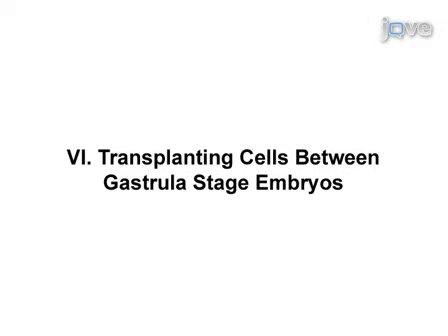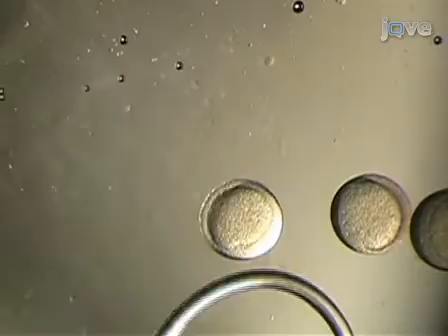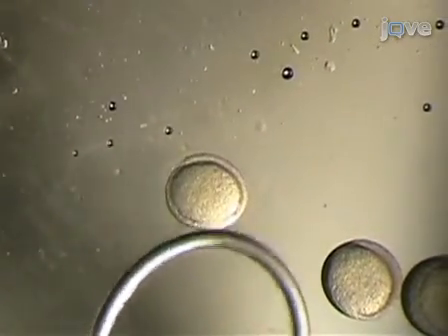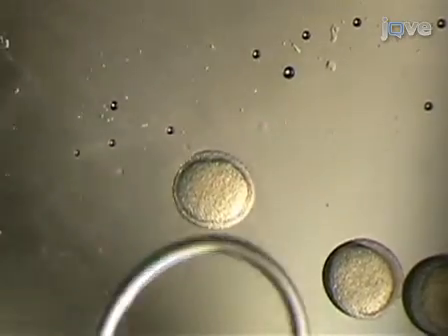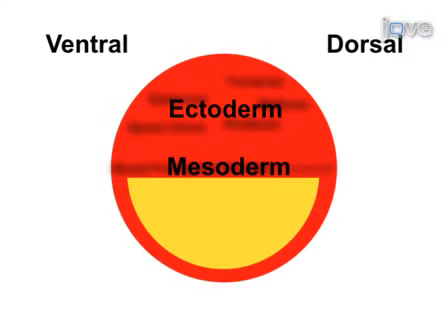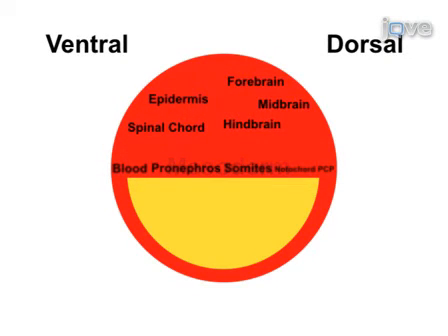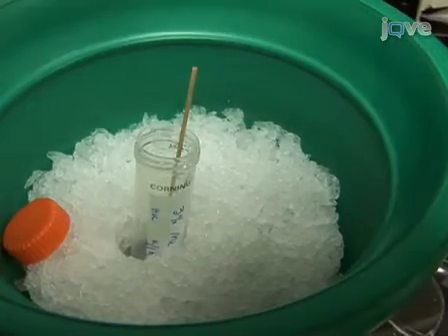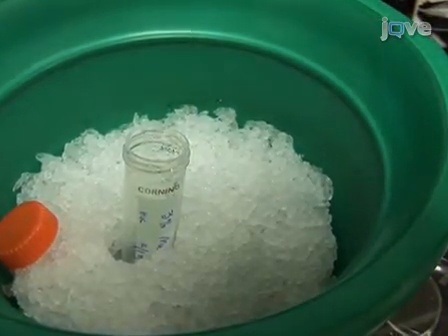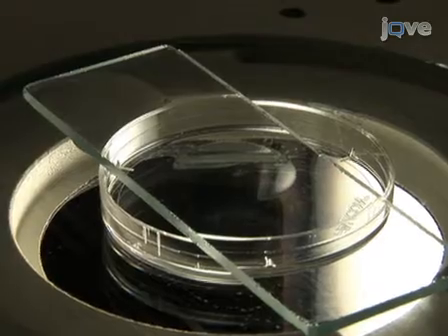Transplanting cells into a gastrula stage host allows the experimenter to take advantage of the zebrafish fate map that emerges when the embryonic shield becomes visible. It becomes possible to distinguish different tissue types, as well as the domains within the presumptive central nervous system. When transferring cells between embryos at the gastrula stage, there are some variations in the protocol, but the general procedure is similar to working with blastulas.